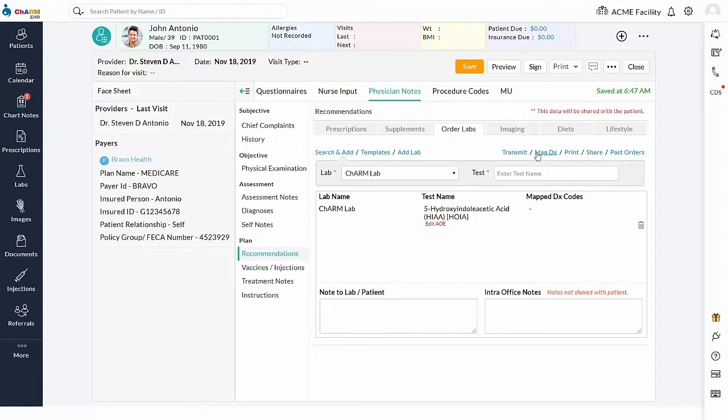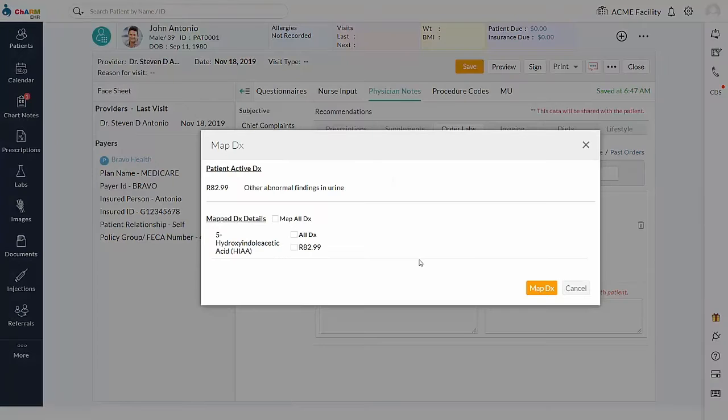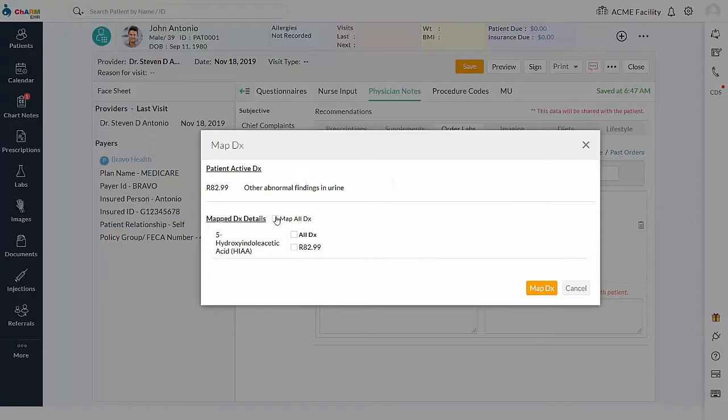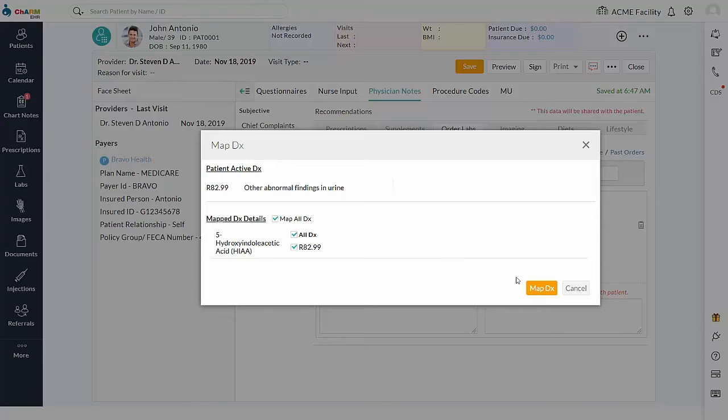Map DX. Once you have ordered the lab test, next you have to map the patient's active diagnosis to the lab orders using Map DX. Map All DX checkbox can be used to map all the active diagnosis of the patient to all tests. Diagnosis can also be mapped at a test-specific level.